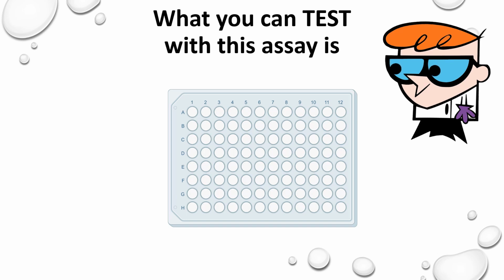First of all, we test the inhibitor on its own on the cells. So you have your preformed colonies, the 1,000 cells that you plated in each well that formed these very compact small colonies. You expose them to the inhibitor. And this is really important because you want to understand what the inhibitor does at different concentrations. Starting at the highest concentration in well A1, let me just get my pointer. And then you dilute them down stepwise all the way to a very low concentration.